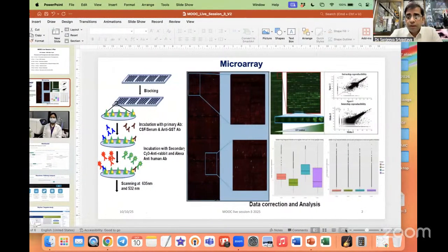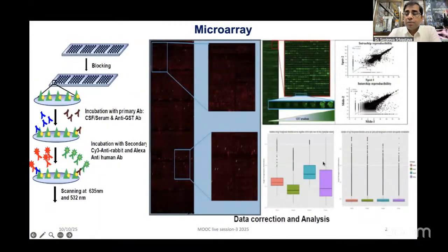Thank you, Vaishali. So it was a good flavor of doing the protein microarray. I'll just flash one slide about what one could do from these scanned images, where Vaishali left off. There are different types of biological questions you can try to address. In this case, you are looking at brain tumor patients from different grades, from control to low grade, grade 1, 2, and 3, and glioblastoma grade 4. We had almost 25 patients from each group.